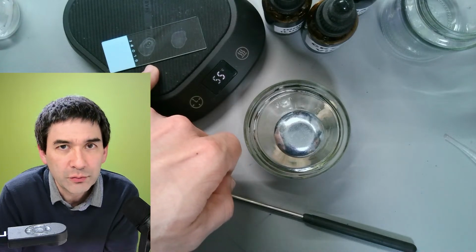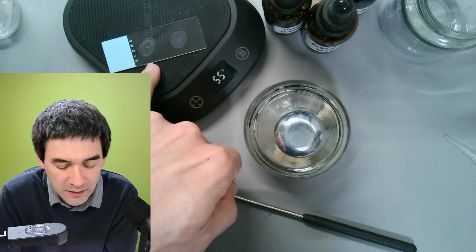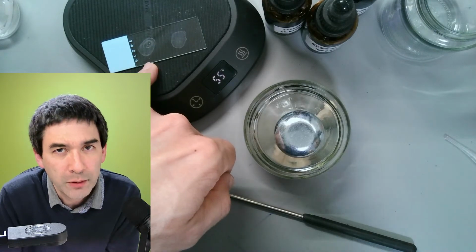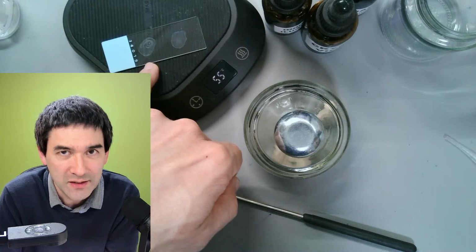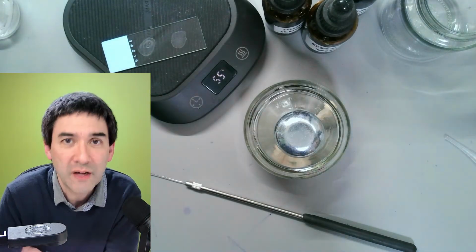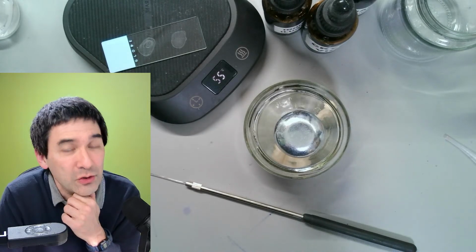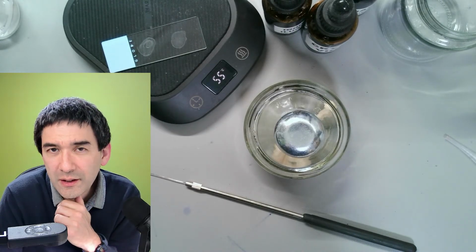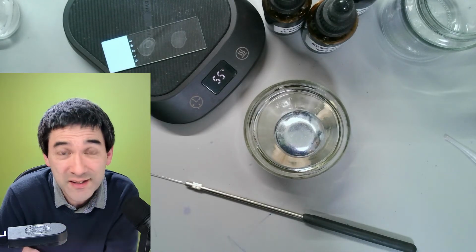Now, I did a lot of gram staining back in the day when I was still at university, and not for identification purposes alone. We did our DNA analysis and other chemical tests to do that, but as a way to characterize it. And I found out that gram staining was actually a thing I did not like to do a lot, because in order to get highly reproducible results, you had to standardize the staining a lot, right?